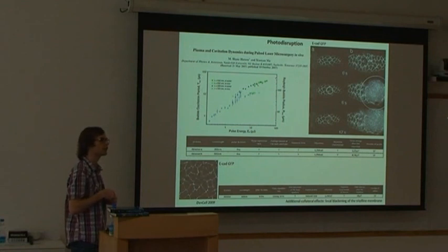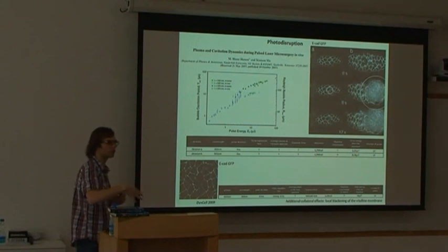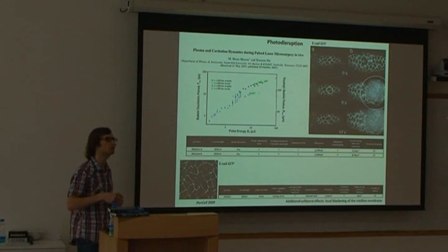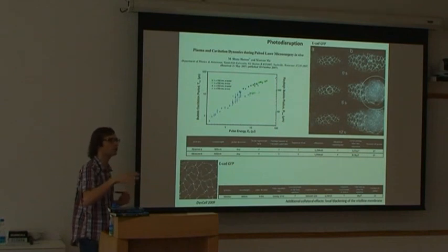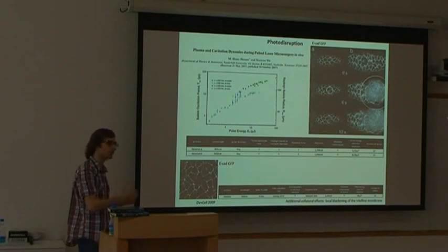What is happening now is that I remember at the time when I started doing laser dissection, it was not much used. So many people were asking what are you exactly doing? But it seems now that laser dissection is widely accepted. So people do not ask with which laser you are dissecting, or which control you should have to be sure that there are no collateral effects. So this presentation is also to make you more critical when you have to review a paper using this kind of tool. Okay? Yes.